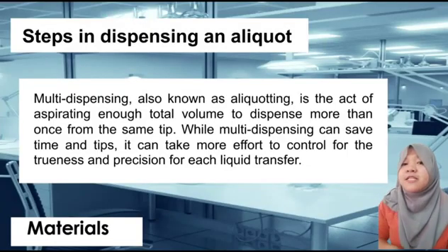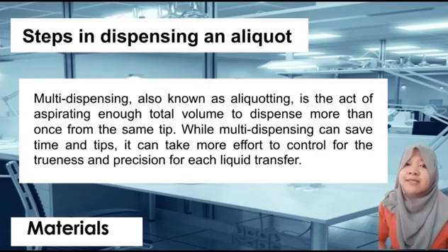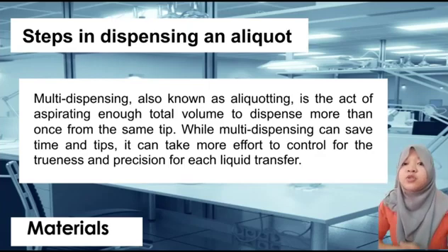Proceeding to the steps in dispensing an aliquot. But first, let us know what aliquoting is. Multi-dispensing, also known as aliquoting, is the act of aspirating enough total volume to dispense more than once from the same tip. While multi-dispensing can save time and tips, it can take more effort to control for trueness and precision for each liquid transfer.